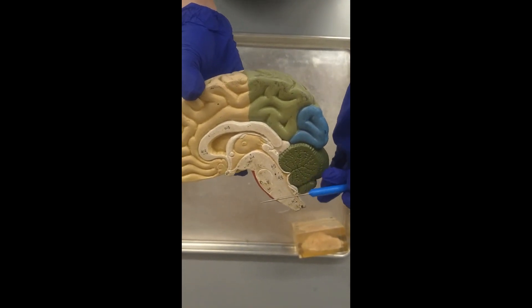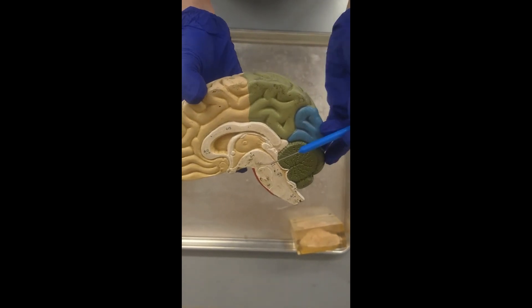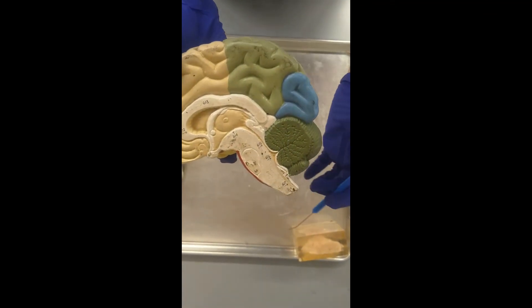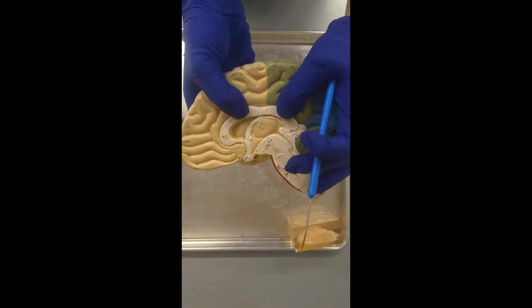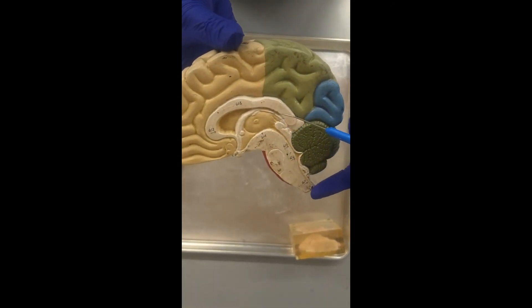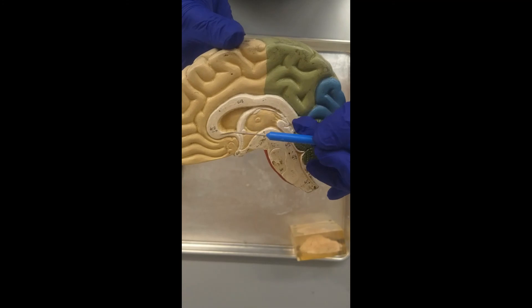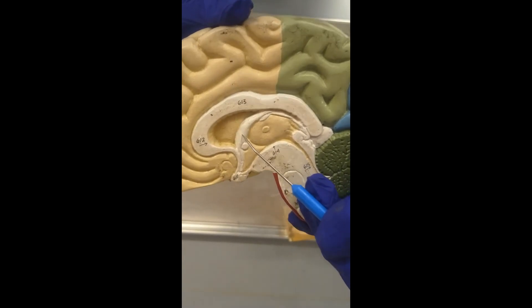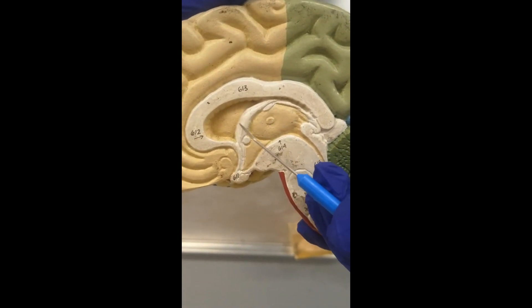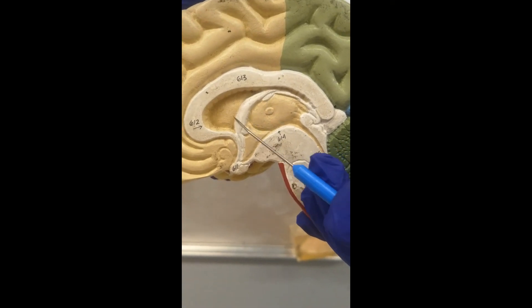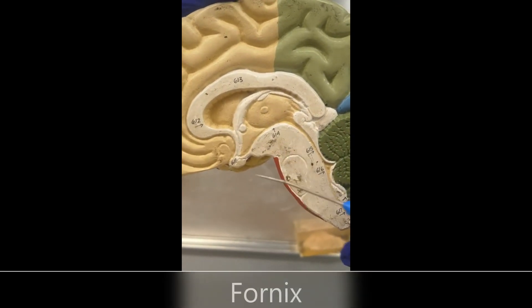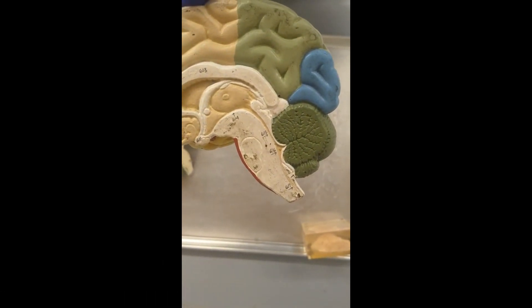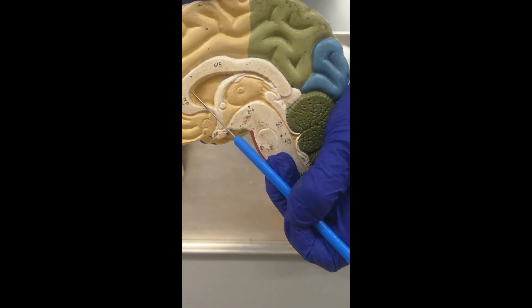We'll actually dissect the corpus callosum in the sheep brain. This corpus callosum is where the right and left hemispheres of the cerebrum communicate. There's also this other little white part — this is the fornix, which is associated with smell. You'll see it's a lot bigger in the sheep brain in proportion to everything else. The other thing we're looking at under internal structures is the septum pellucidum.